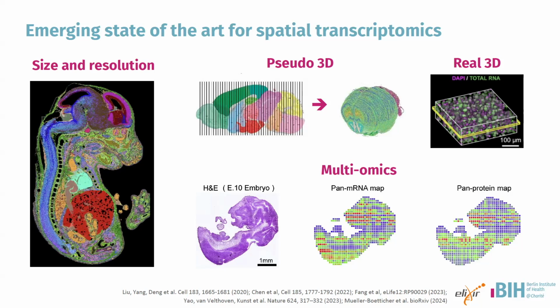This is massive. If we think about technology such as Xenium, these can go up to 2 by 1 centimeter. Visium is in the order of just under 1 by 1 centimeter. So with 13 by 13, we're talking about entire cross sections of human organs, which is typically not analyzed in the pathology context because they're used to constraining themselves to these slides. So the possibilities here are huge.